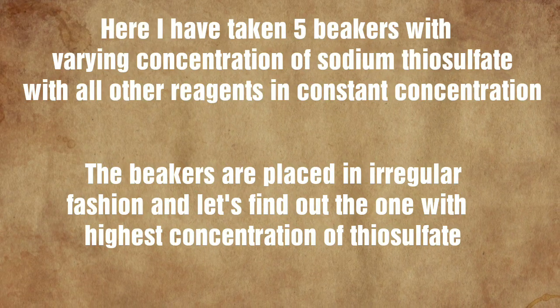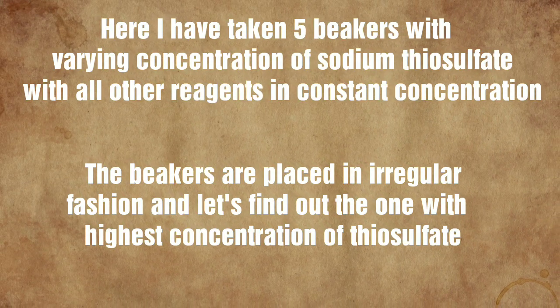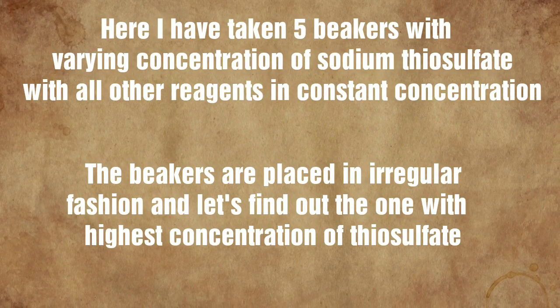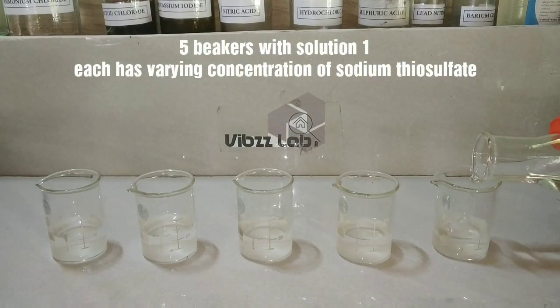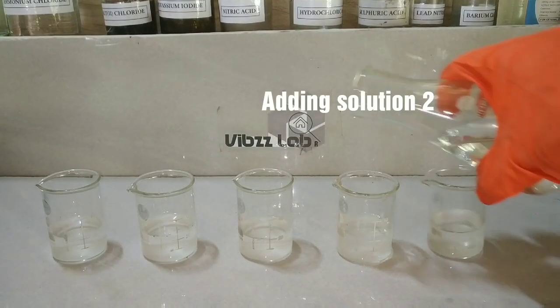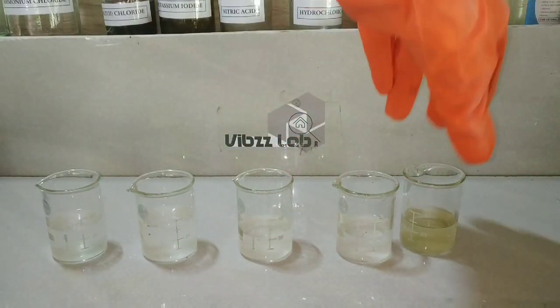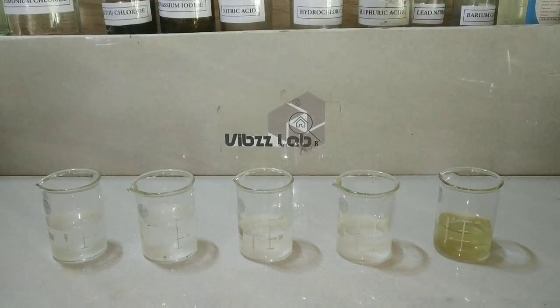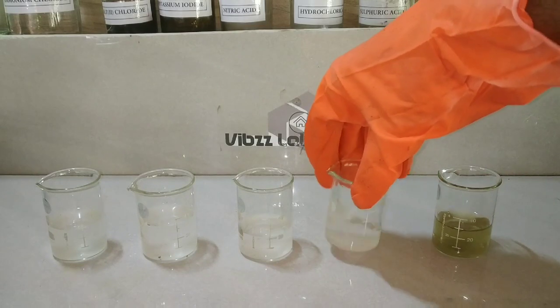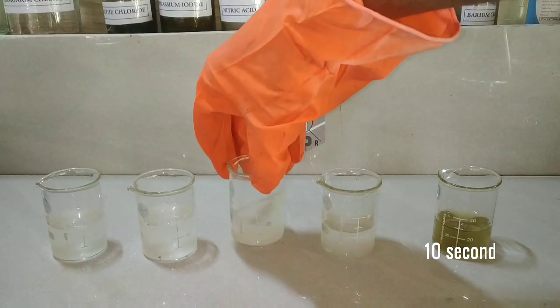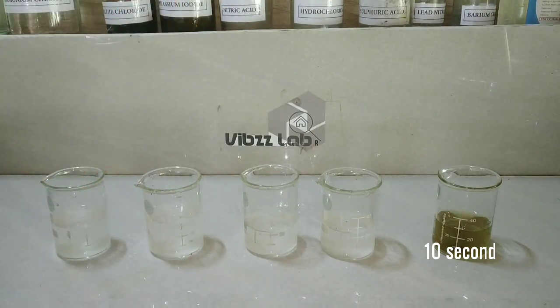Now we will see the chemical kinetics. I have taken 5 beakers with varying concentrations of sodium thiosulphate, with all other reagents at constant concentration. Now I will be adding solution 2 into all these beakers. You can see that as soon as I have added the solution, the color change has occurred in the first beaker within 10 seconds. Now we will wait for the next beaker to change color.